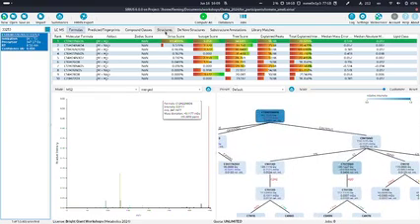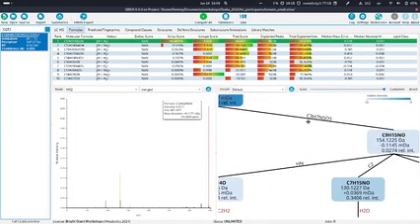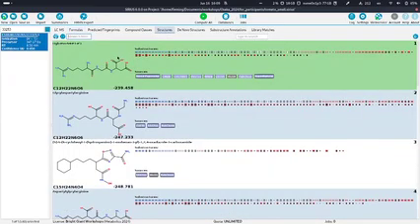What you can see here is that the structure doesn't seem very good. You have many substructures which don't match. And what I'm not going to explain in detail here, but what you could see, let's go back to the fragmentation tree. You will see if you zoom in here that there seems to be a loss which contains 3 C atoms and 5 N atoms, nitrogen atoms. And you will see that this is impossible with this particular structure. It's impossible that you have a loss like this where only 3 C atoms fall off, but 5 N atoms.